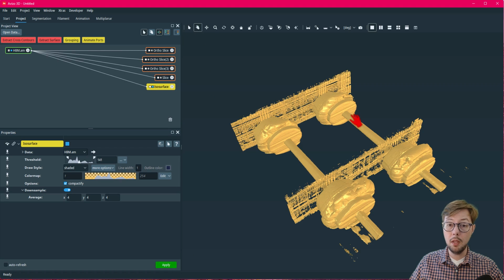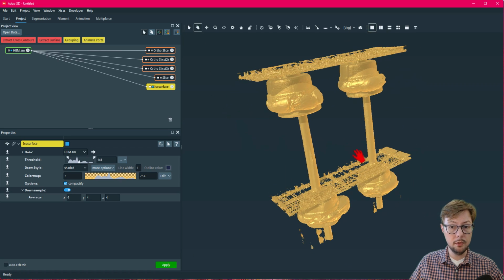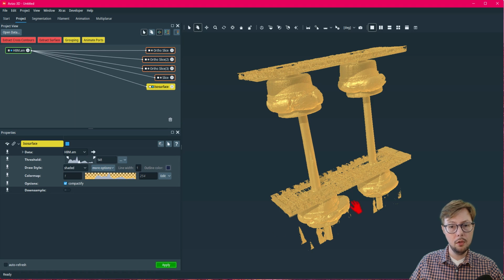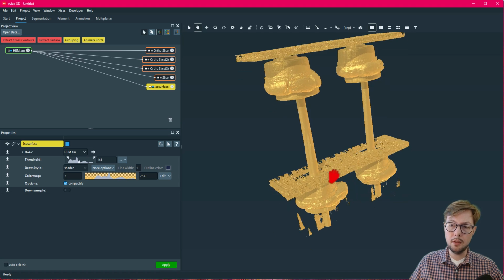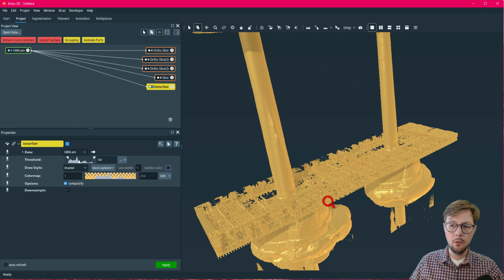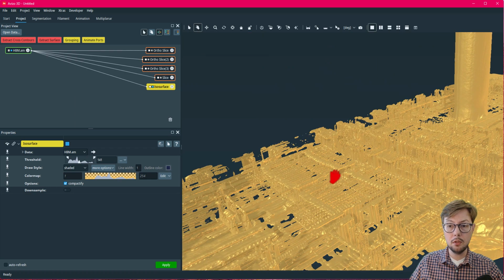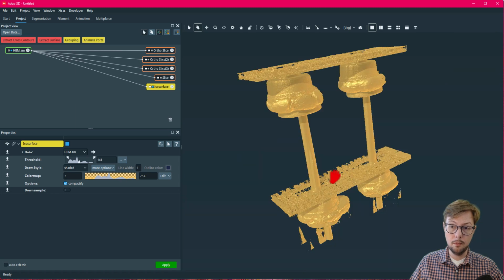Click the green Apply button to draw the isosurface. Here, I show the process with and without downsampling. Once computed, you can use the 3D viewer to zoom and pan the data. We will again hide the display of the Isosurface module to illustrate a direct 3D rendering.